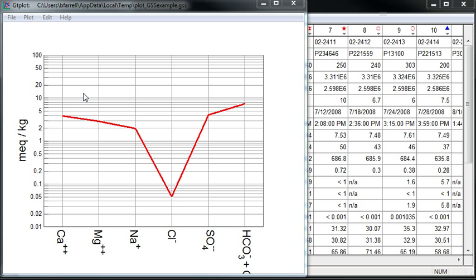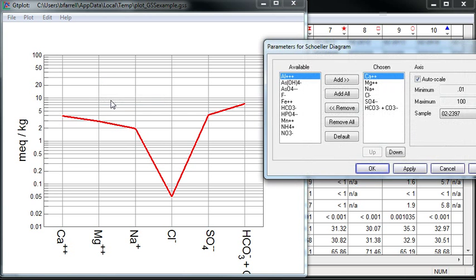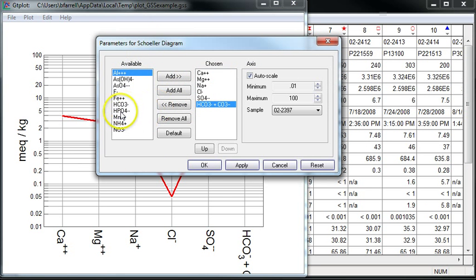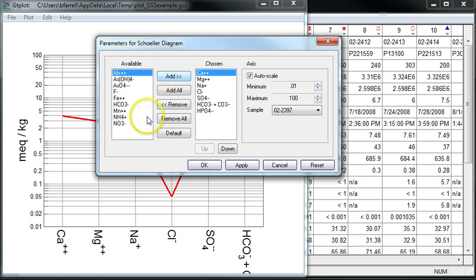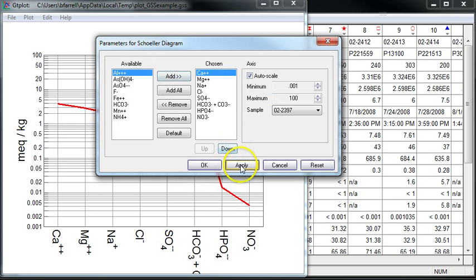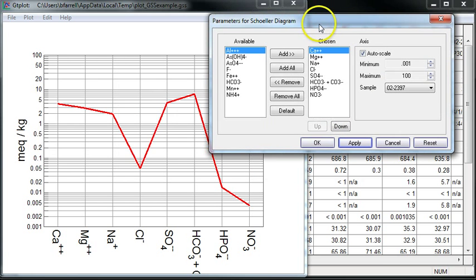We can edit the diagram by right-clicking on it and choosing Configure Plot. Here I can add components to consider by selecting them from this available list and choosing Add. I'll click Apply to update the diagram.